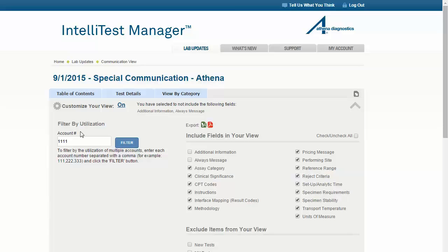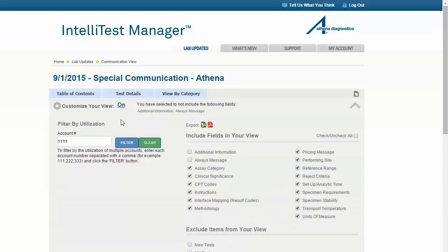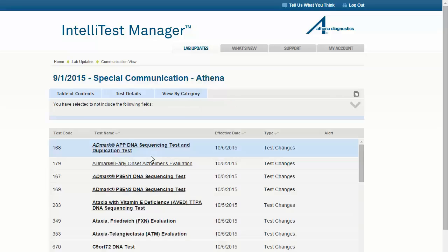To further customize these updates, you can filter by utilization. The account number that you logged in with will be listed here by default, and associated account numbers can be added by separating them with a comma. Clicking Filter allows updates to display only if they relate to tests included in your rolling 12-month test utilization. Regardless of this filter, communications about new tests always display to provide you with the latest test information at your fingertips, unless you selected to exclude new tests here. To return to the main unfiltered list, simply click the Clear button.